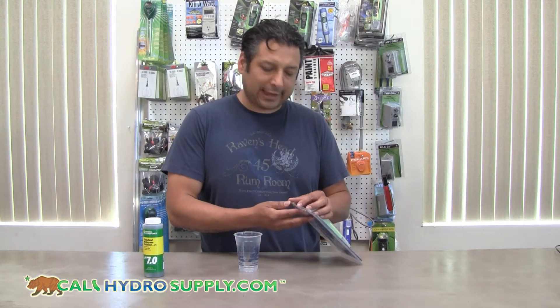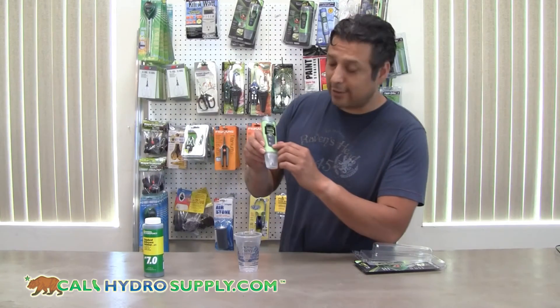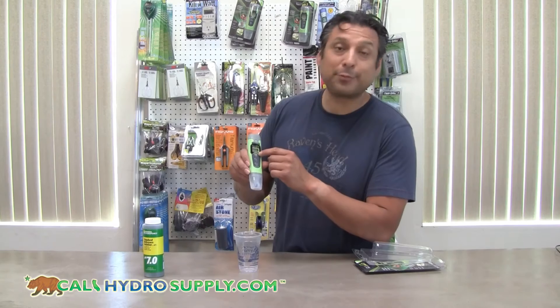First you take it out of the package. As you can tell, it has an on and off button, a calibration and a hold button.